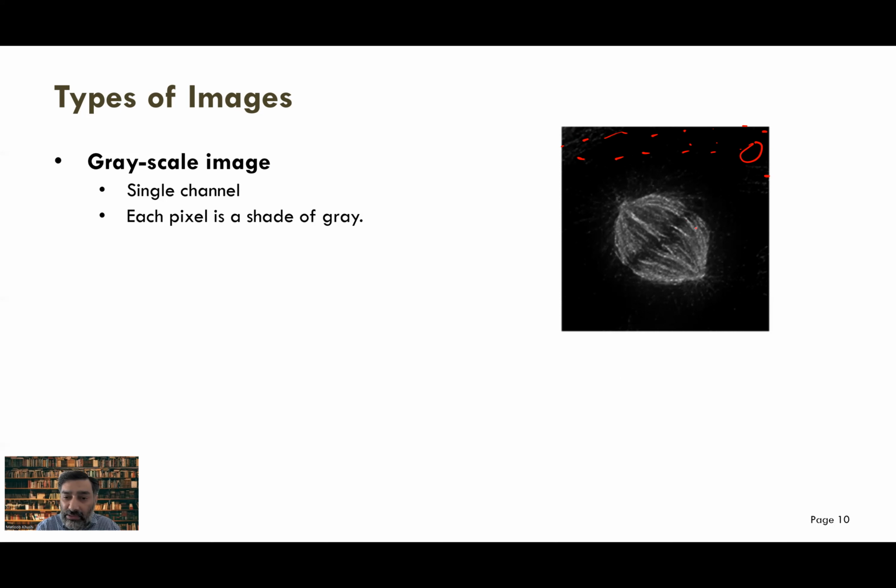And the pixels that are showing a spindle, with the DNA supposed to be in the middle, this spindle must have a value higher than 0. It could be 5, 10, 20, 30, 100, because they look brighter, right?